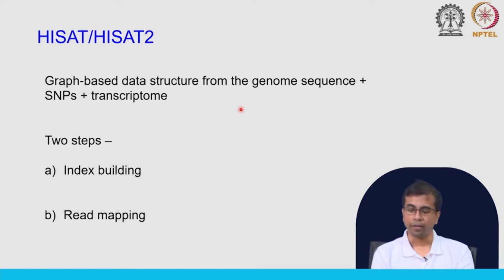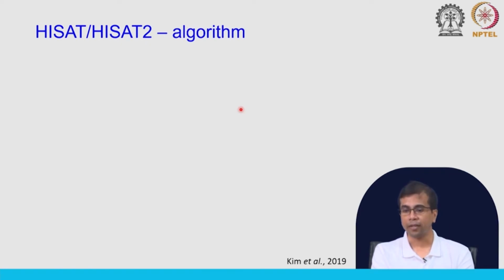Okay. So, what we will do now is very briefly look at the algorithm, of course, without going into a lot of details of the implementation, and a part of it you will understand very easily because we have done the Bowtie2 discussion when we discussed genome analysis. So, how does this algorithm work? Let us take an example reference genome, GAGCTG, from the paper that proposed this algorithm.